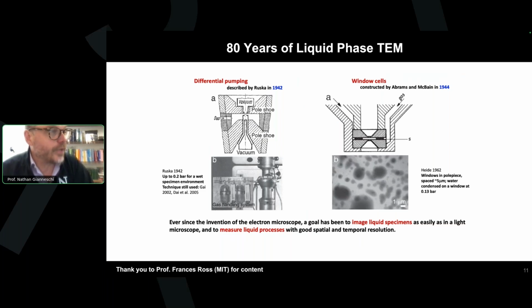Frances, I have to give a thank you to her. She made these sort of historical perspective slides at a Gordon research conference we hold on liquid phase TEM, which is, by the way, open now for abstracts and things for February as well. She first presented this, and it gives a little bit of a context. A lot of the deficiencies in these measurements really came from our ability to make thin enough windows, small enough windows in liquid cells in order to study materials in liquids with even a hope of getting enough contrast to observe the kinds of things I'll show you in a second.